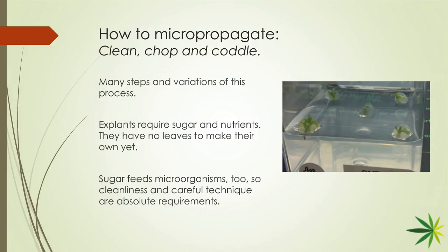Now, how do you coddle them? How do you chop them? The method that I've implemented in this particular figure, you see those growing tips. They look like they're in some sort of a bead of their own, and so they are. This was a two-step process. The gel material that fills most of the culture container is gellan, or Gelrite. It's a seaweed-based growing medium common in microbiology and in plant tissue culture. But the growing tips were encapsulated in a separate process in a related material called alginate, which sets up differently. You don't melt it, you use chemistry to get them to set up.